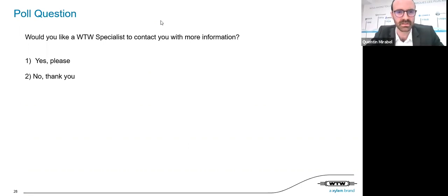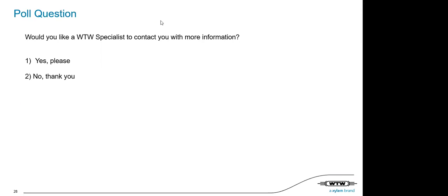Okay, thanks. Another question. How many samples are required? Good question. I always say as many as possible. From experience, 5 to 10 samples is a good start to have a reference and have the right value pairs for it.